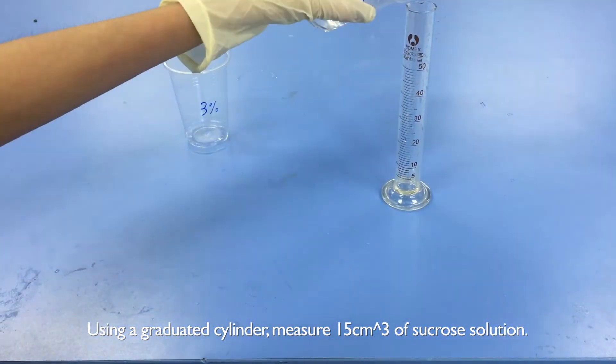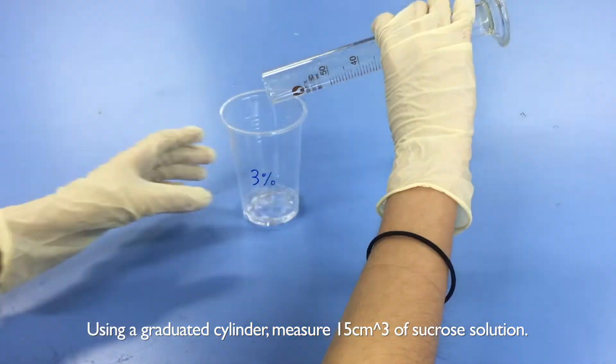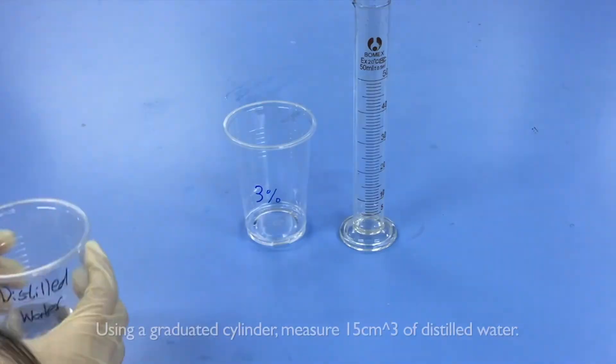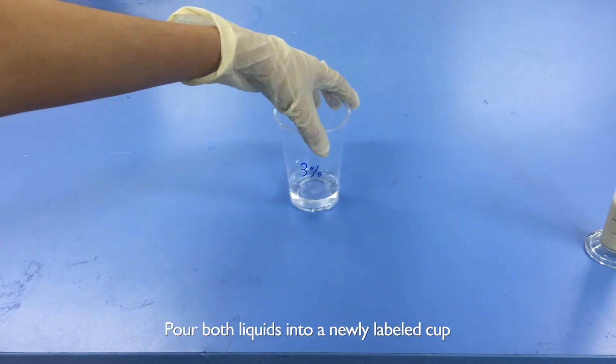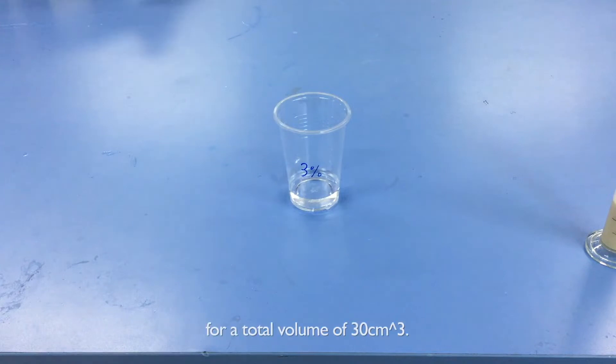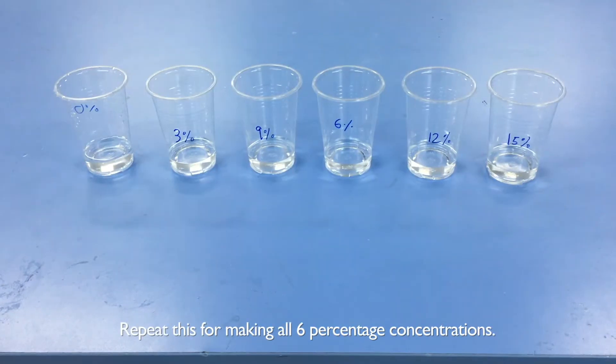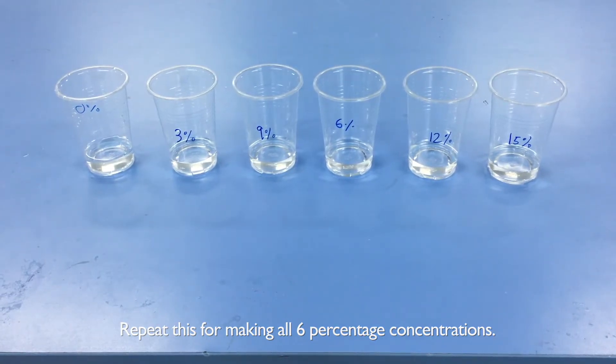Using a graduated cylinder, measure 15 cubic centimeters of sucrose solution. Using a graduated cylinder, measure 15 cubic centimeters of distilled water. Pour both liquids into a newly labeled cup for a total volume of 30 cubic centimeters. Repeat this for making all 6 percentage concentrations.